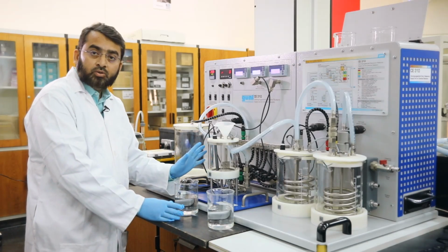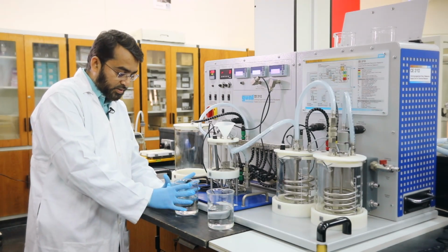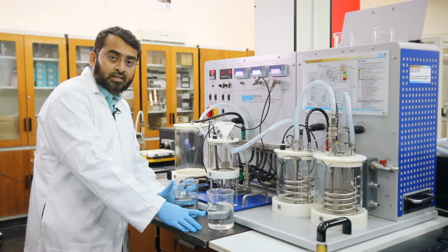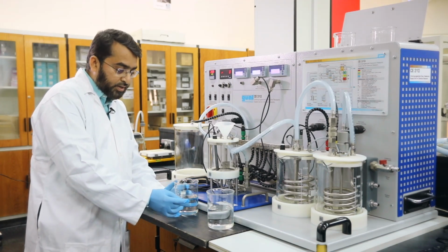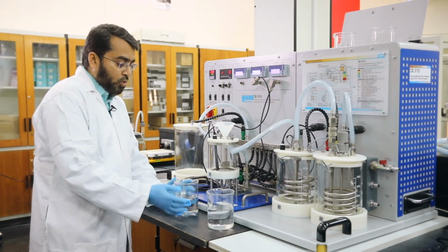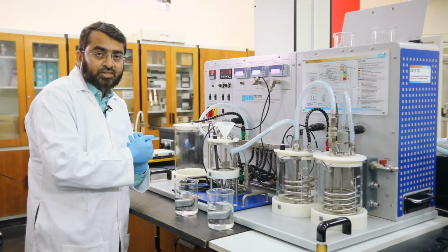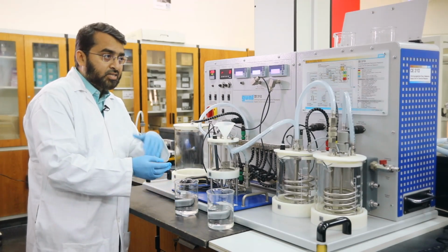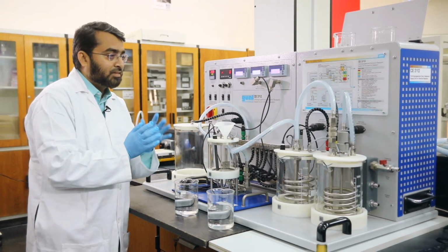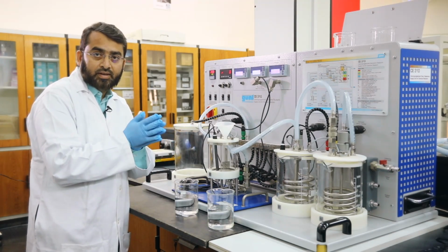What we are going to do is mix 400 milliliters of sodium hydroxide and 400 milliliters of ethyl acetate. The concentration here is 0.05, 0.05. When we mix it, the volume will be doubled, so your initial concentration will be half of the 0.05. So you will be starting with the concentrations Ca0, Cb0 of 0.025 molar.